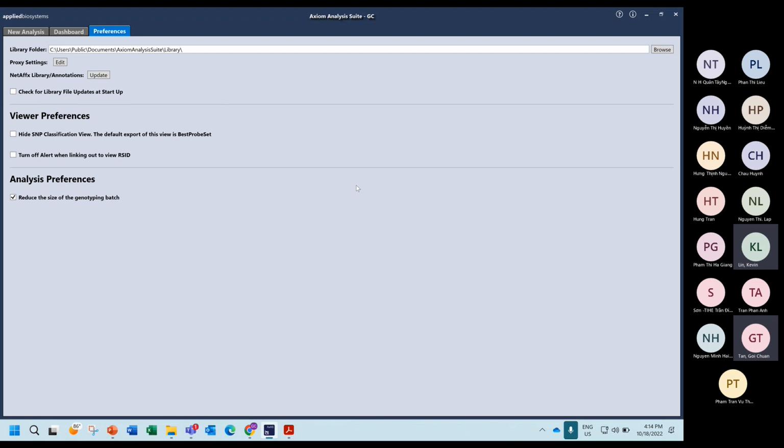Just now I saw that on a lot of your computers it takes a long time to log into the software. That's the reason. So turn off this option. However, when you have a very good internet connection, after you create an account, you click update and you go inside. Remember, don't download all the library files you see, because it takes a lot of space.